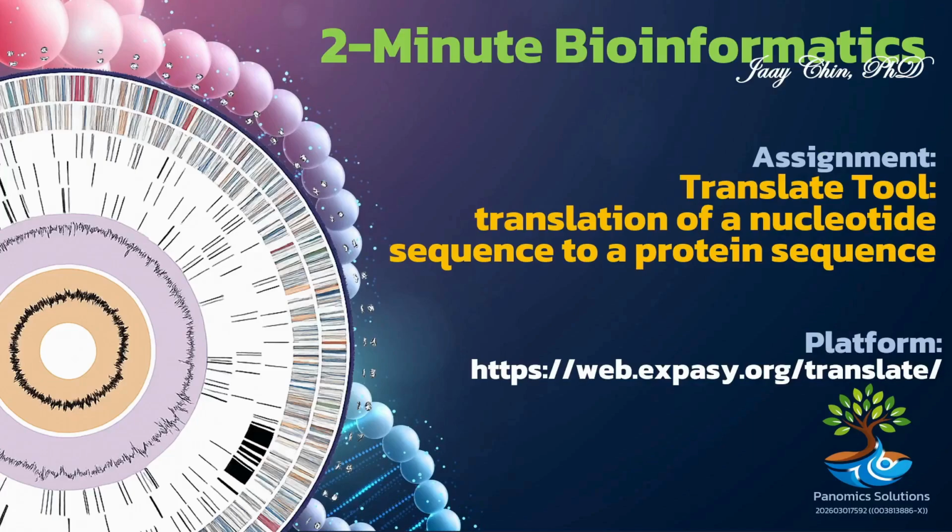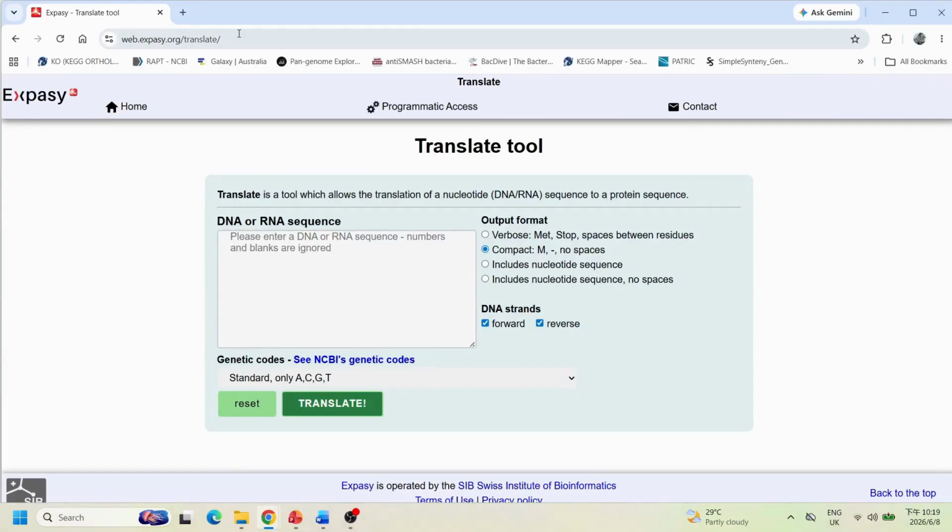In today's short video, we will learn how a DNA or RNA sequence can be translated into its corresponding amino acid sequence in just a few clicks. Let's dive in and learn how sequence translation works.